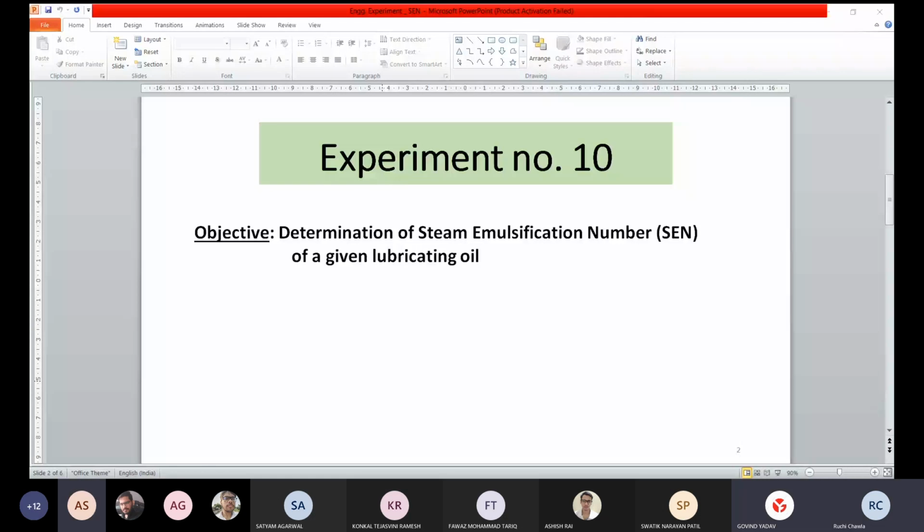It is the time interval in which emulsion of oil and water gets separated out. Time, okay, it is a time, so you are touching actually the physical quantity correctly. Anything else that is included in the definition? Is the unit also included?